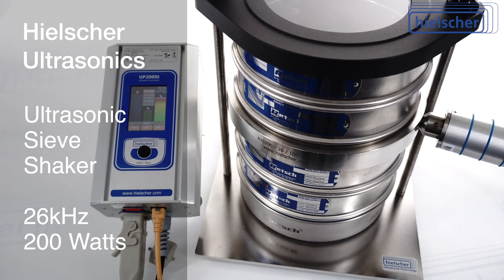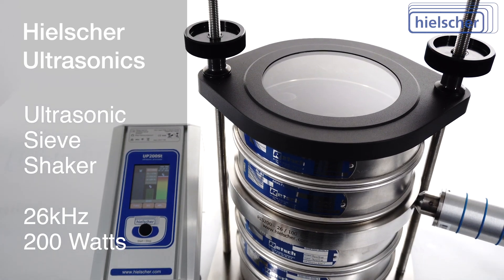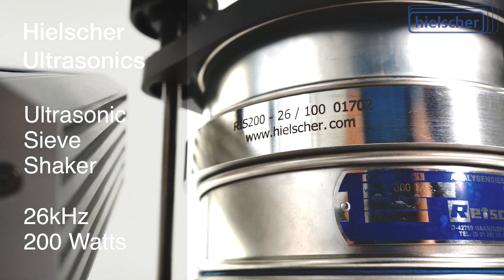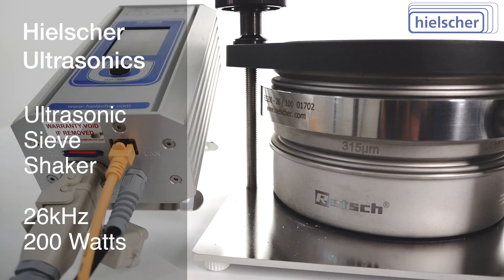The Hielscher ultrasonic sieve shaker is available for all standard laboratory sieves and test sieves with 200mm or 8-inch diameter. In addition, Hielscher also manufactures sieve shakers for other diameters and for customers' specific requirements.